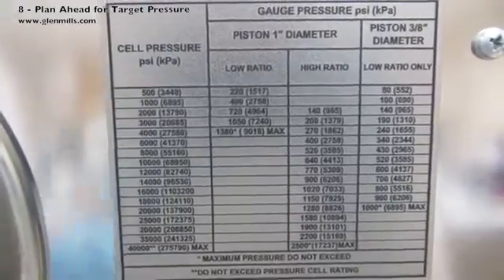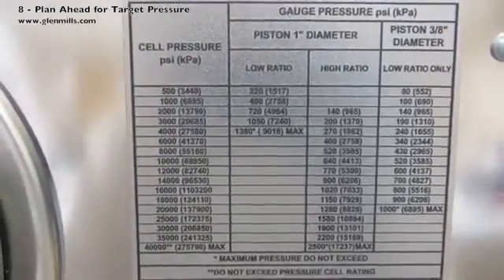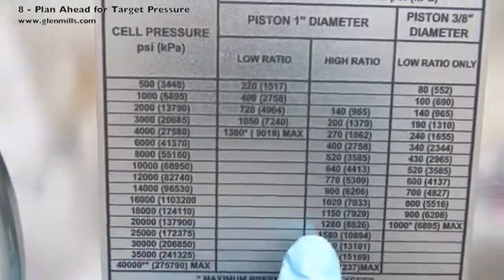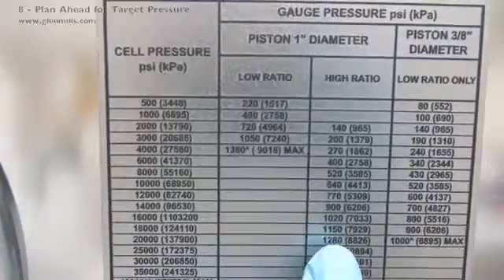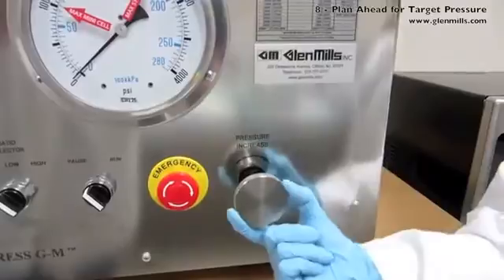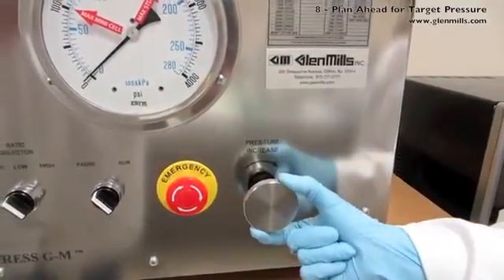For example, suppose the biological cells need 20,000 psi to properly rupture. The conversion table shows this is 1280 psi on the gauge. During the run, the pressure increase valve will be rotated until the gauge reads the needed 1280 psi.